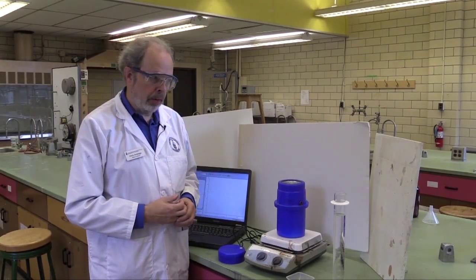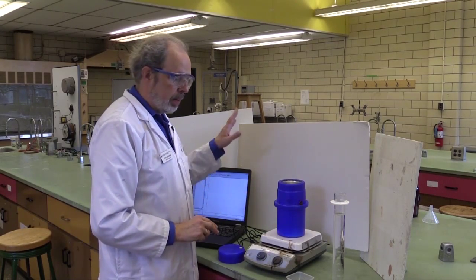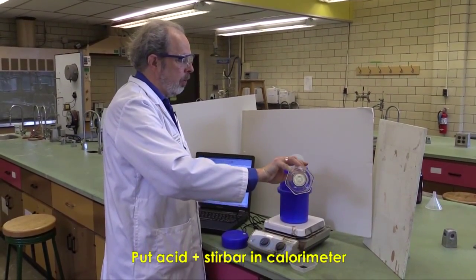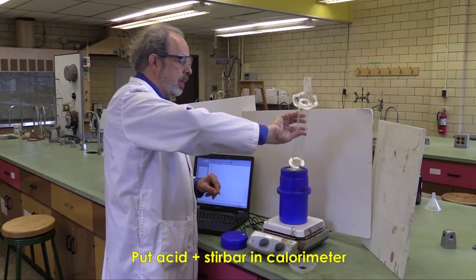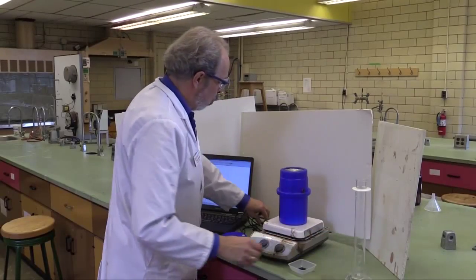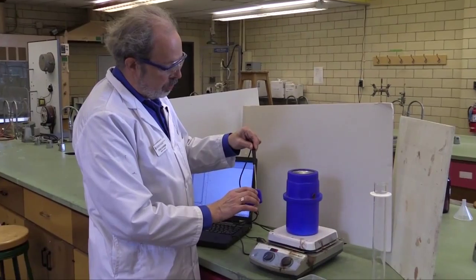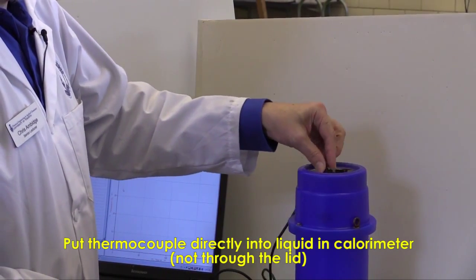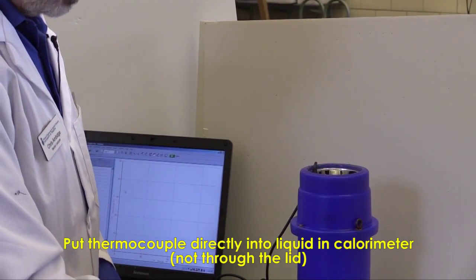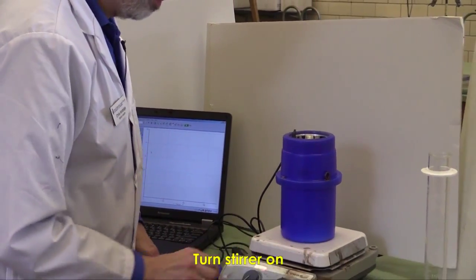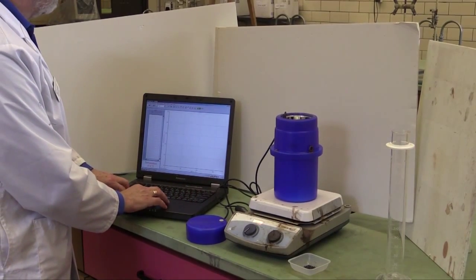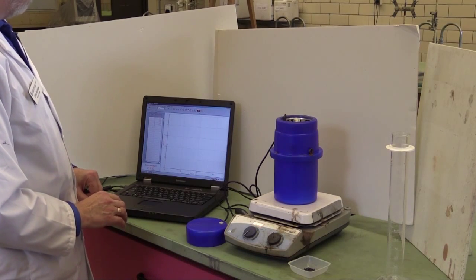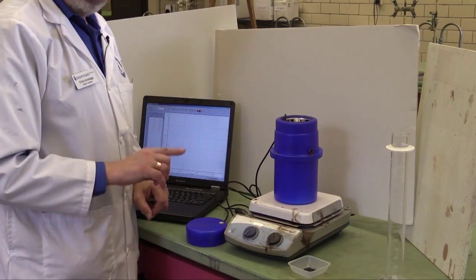We're back here now at the calorimeter. I've got the 250 ml of hydrochloric acid that I measured out earlier and the magnesium solid. The first thing to do is put all of the hydrochloric acid into the calorimeter. Now, it's at room temperature, so it won't be warming up. Here is the thermocouple. Now, if I put it through the hole in the lid, it's too short. It won't actually reach the hydrochloric acid. So I just put it directly into the dewar flask. Turn the stirrer on, so I've got motion happening there. And at this point, we can start collecting. Click on the green button.